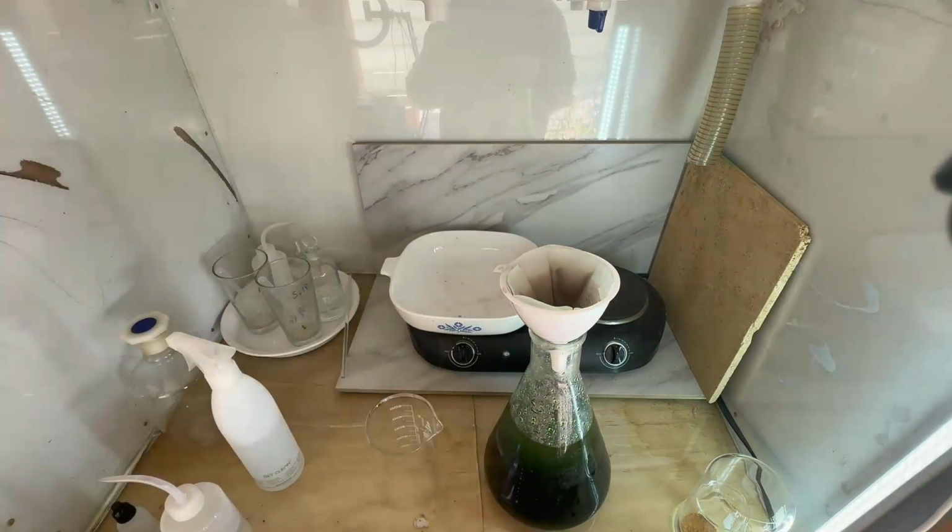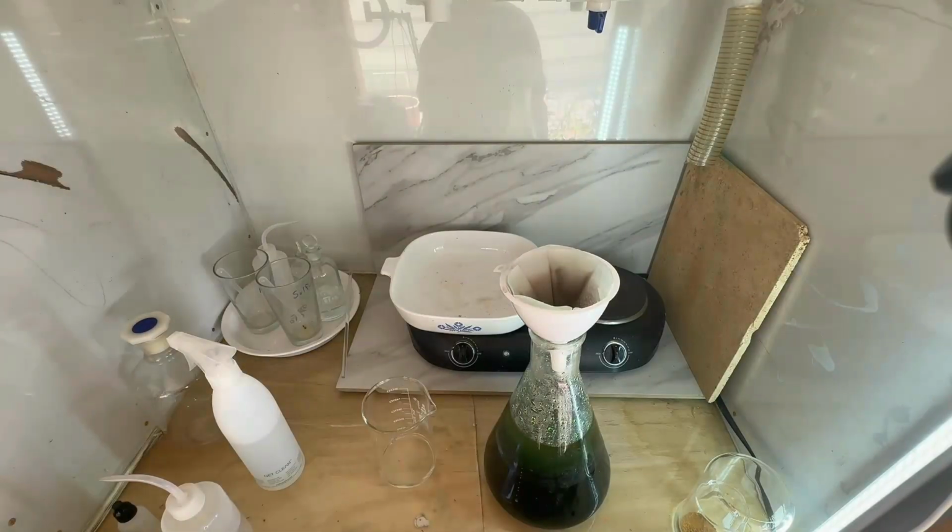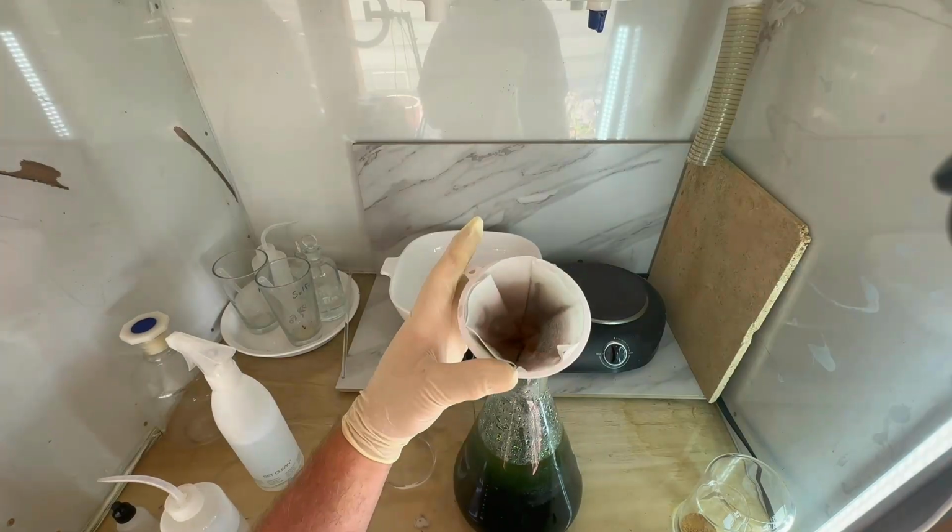Now that we're fully filtered, I'm going to go ahead and do a quick wash of what's in that filter with some hydrochloric acid. Just kind of clean it up a little bit before we move on to refining the gold.